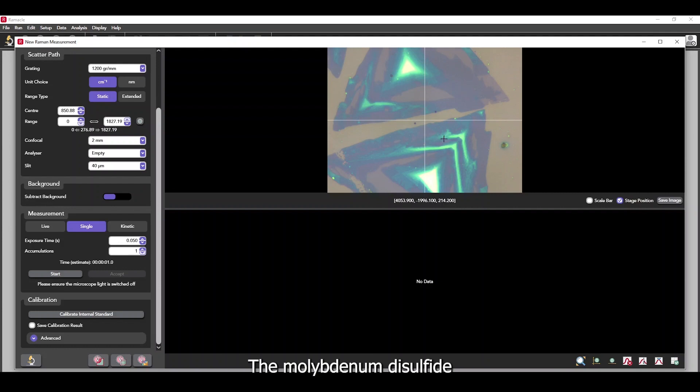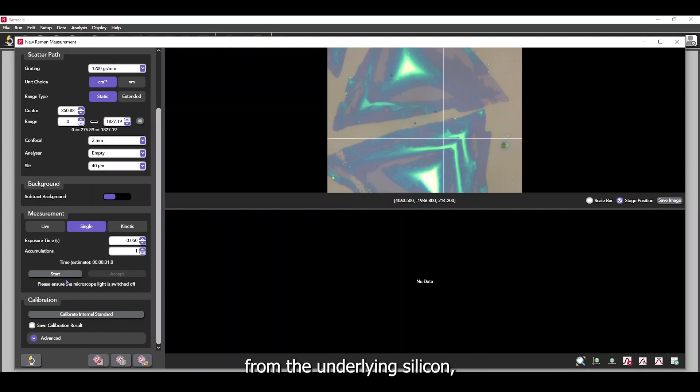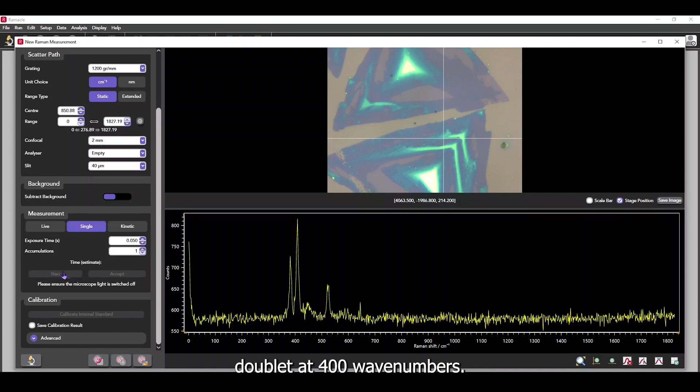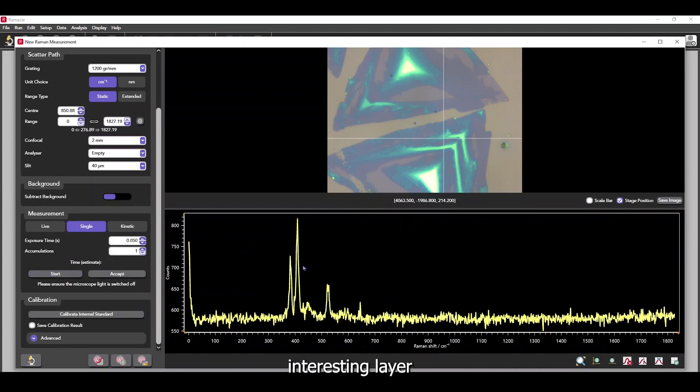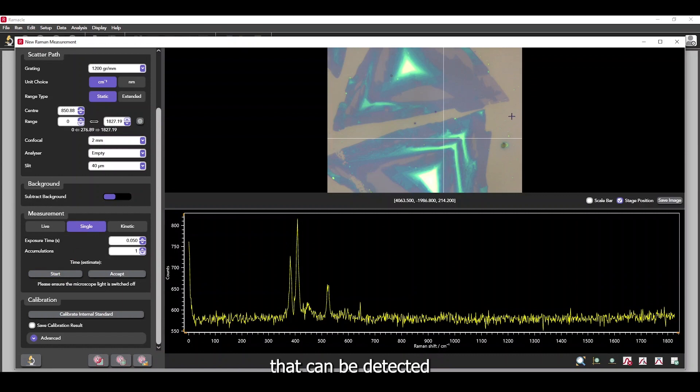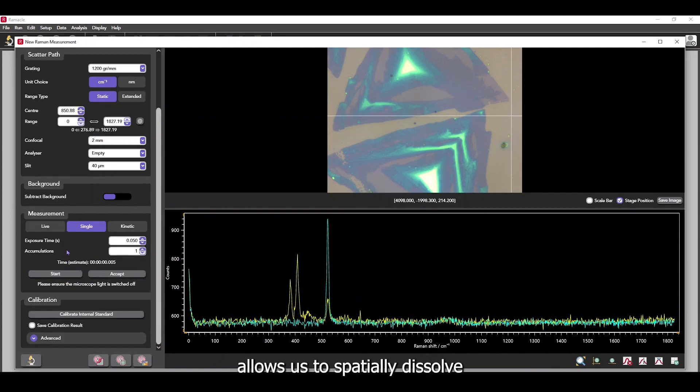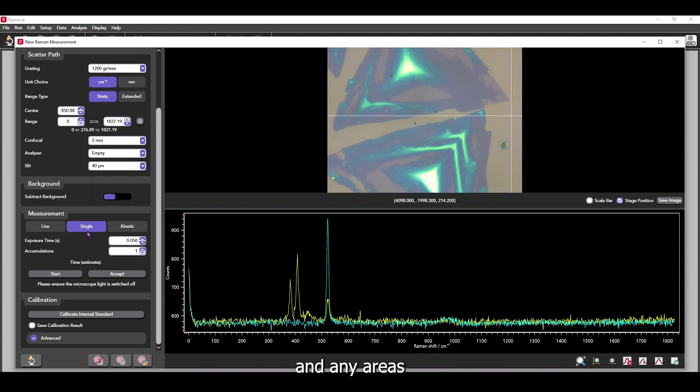The molybdenum disulfide is chemically distinct from the underlying silicon and exhibits a unique doublet at 400 wave numbers. It also has several interesting layer dependent properties that can be detected using Raman spectroscopy. So mapping it allows us to spatially resolve the edges of the crystal and any areas where the number of layers and the material changes.